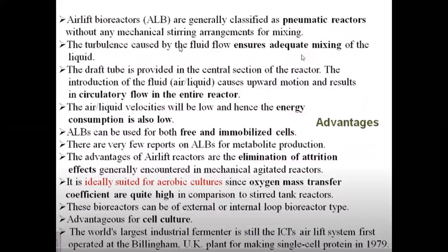Airlift bioreactors are generally classified as pneumatic reactors because there is no mechanical stirring being done, and the turbulence caused by the fluid flow ensures adequate mixing. Because of the fluid flowing in the riser and the downcomer, the turbulence is causing the mixing of the nutrients, microbes, and other substrates. The draft tube is provided in the central section of the reactor. The introduction of the fluid causes upward motion and results in circulatory flow in the entire reactor.